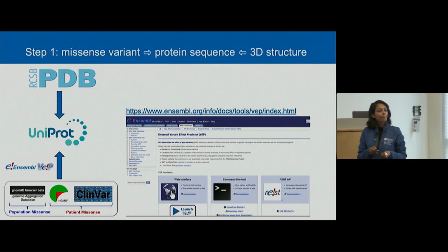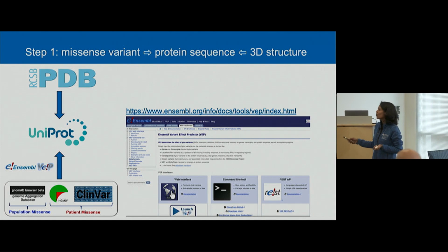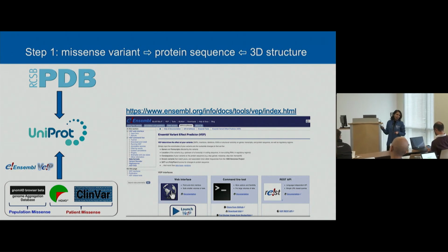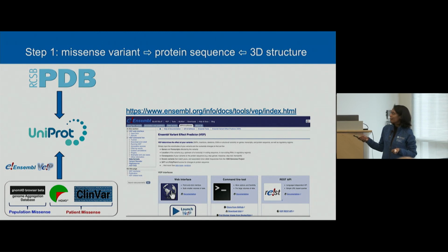What's it relative to? I'm sorry? You're mapping onto the 3D structure. Yes. Don't you need some coordinate? Yeah, so of course, in the 3D structure, we are mapping onto the C alpha atom. And that is the amino acid position on structure. And in sequence, we have the amino acid position. And for the variant, we have the genomic positions, right? But using Ensembl, we can get the corresponding amino acid that a variation is mutating in the protein sequence space. From the PDB of the C alpha. Yes.